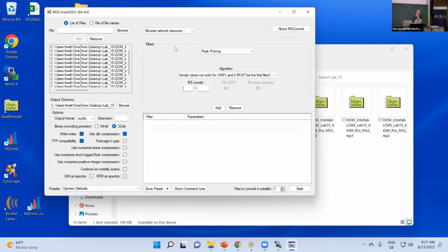of, I don't know, what was it, up to 2 ppm? Yeah, I mean, it was like the mass of an electron, 0.0005 or so at 400. Yeah, pretty high, like 3 ppm. Yeah, sometimes higher. But I don't know if it's a continuous wavelet transform algorithm or if it's a different one.